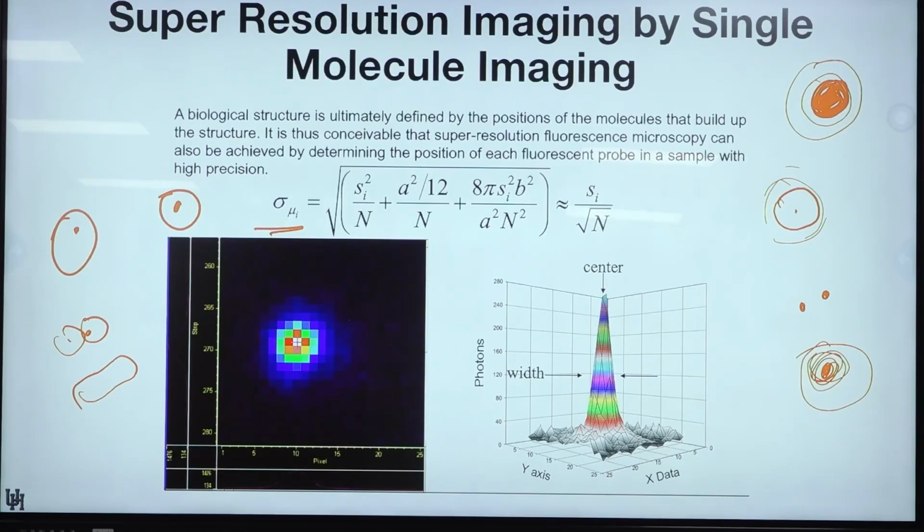As long as within one measurement there is only one dot, you can find the location of the dot very precisely. And if you can make different parts of the structure emit light at different times, then you can literally connect the dots and make a measurement. I'll tell you how exactly they did that.